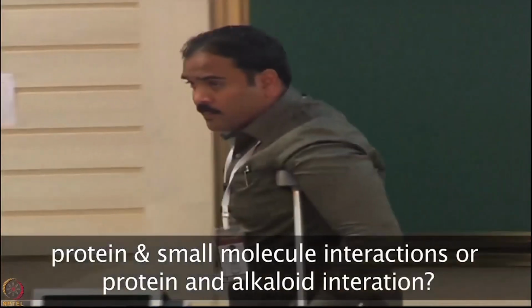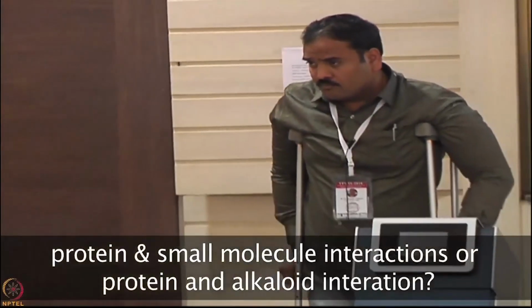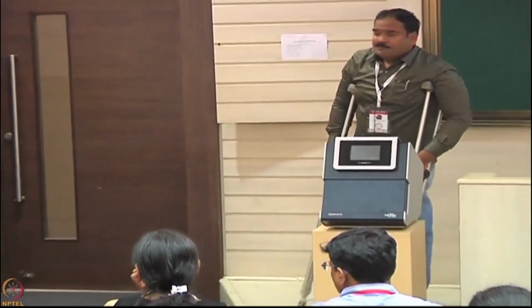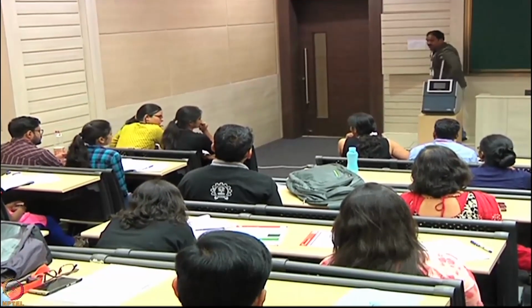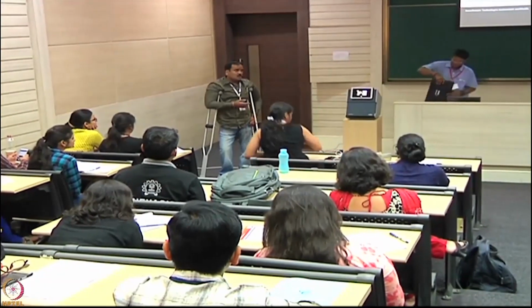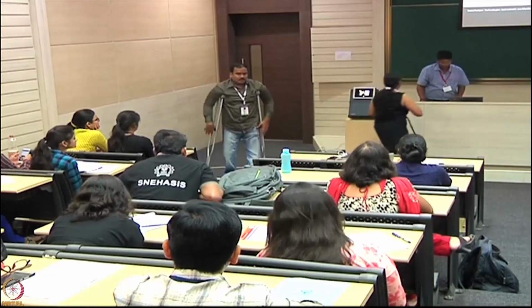Protein and small molecule interaction, then protein and this alkaloid. See, that's what I'm saying. In principle, anything is possible. Alkaloid, can you tell me an example? Curcumin. So very recently, as I said, 15 minutes is the measurement time. So maybe people can come to the front and just wander, or you can sit there and see however you wish.